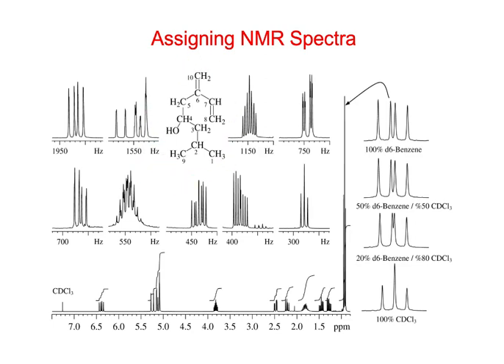So I think that the first thing you want to do if you want to assign some of these is pick out some unique positions on the molecule that might have a characteristic chemical shift, or in this case, a splitting pattern, and try to start by identifying one of them. Well, the isopropyl is going to be a septet.